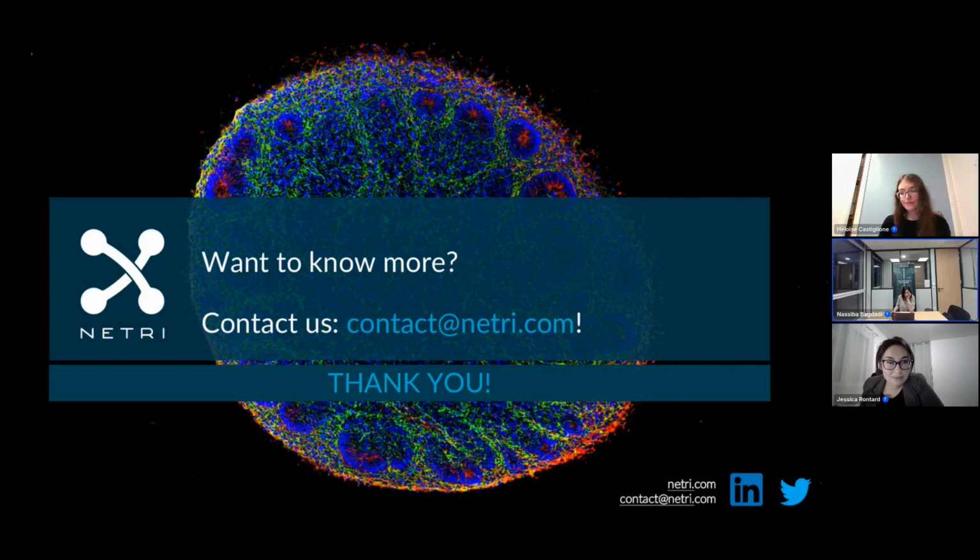Are there any other questions? Someone is interested to know if it's possible to record electrophysiological activity on the brain organoids in our chips. Yes, I can take this question. It's not possible to record the electrophysiological activity directly in the duplex device.